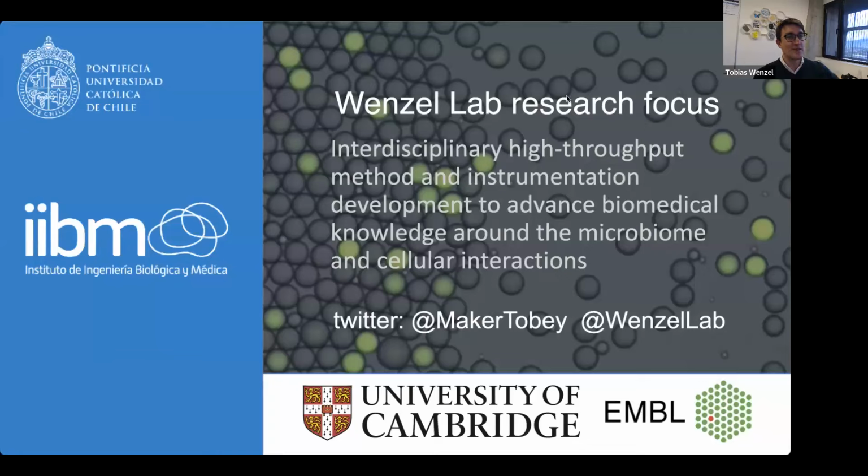So my research lab, the team that I'm leading here at the Universidad Católica de Chile, we focus on interdisciplinary research. So we have students from very different backgrounds to develop high throughput methods with droplet microfluidics, as well as instrumentation to advance the biomedical knowledge around the microbiome and cellular interactions. So that means the interaction of bacteria in the microbiome, but also the interaction of bacteria with other kind of cells.